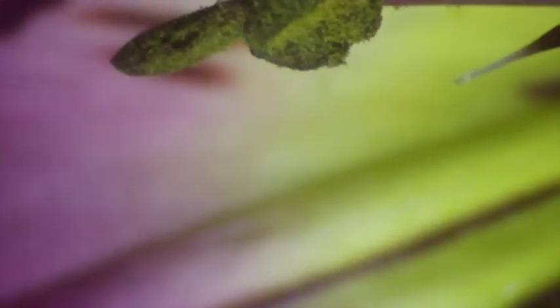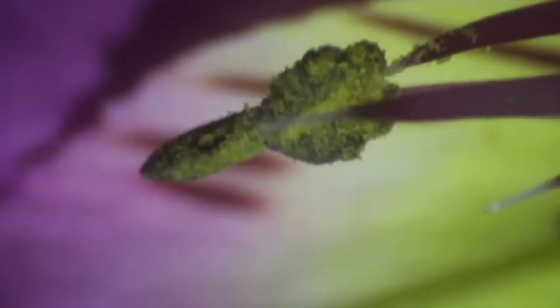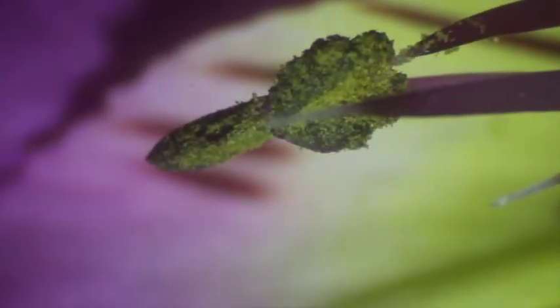So here, just go in and focus on this pollen grain. Okay, if I can get it. So if we can get this to focus in. I'll zoom in and take a close-up look at these pollen grains on top of these stamens.